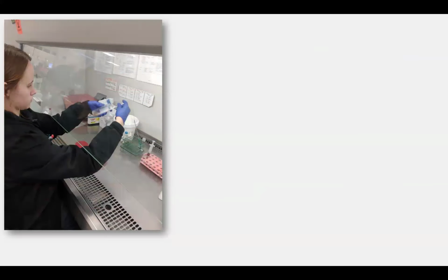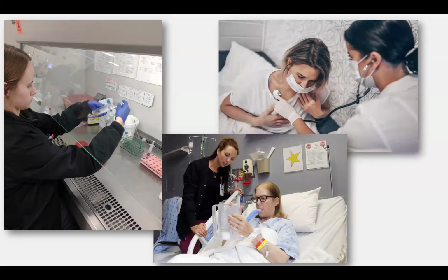And all of healthcare is built around that now. I can't fuss about us in the laboratory all that much with regards to this, because this is the way we handle the specimen. This is Paige sitting there working with a sputum specimen in a biological safety cabinet. We're really not going to be exposed to anything that could be in that specimen. To be honest with you, I'd much rather be doing that than going through what physicians, nurses, respiratory therapists and other healthcare professionals have to do when you're actually working with the patient. We deal with these specimens under very controlled, contained situations, as opposed to a patient who's coughing up who knows what. So I'm not going to talk about that kind of stuff today.